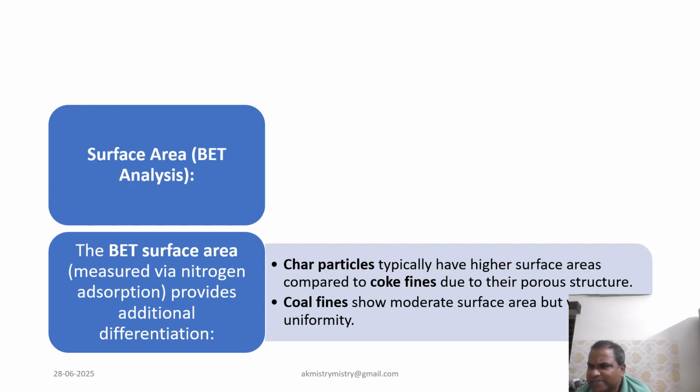The surface area, that is the BET analysis. It explores BET surface area analysis measured via nitrogen adsorption. Char particles have higher surface areas due to their porosity.